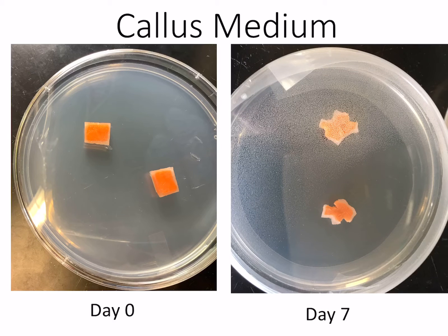First, our callus medium — the one that had relatively large, equal amounts of auxin and cytokinin. On the left is our day zero, a reminder of what the tissue looked like when placed on the medium. On day seven, to the right, we see the tissue is beginning to swell. That's a good thing. It means the cells are alive, taking up the medium and nutrition. Some are expanding and hopefully dividing — it's a little too early to tell. But the fact that they're misshapen and cracking open, that's a good thing.